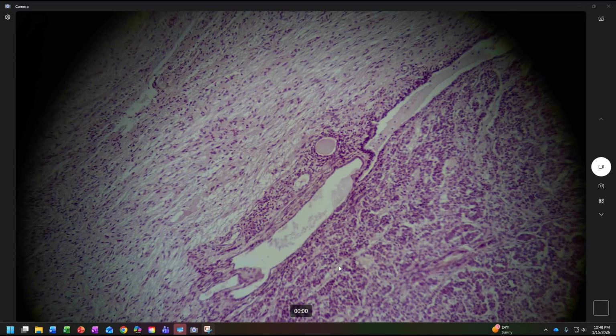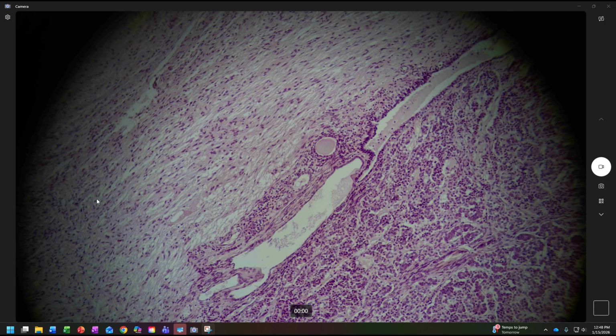Now, again, this doesn't look exactly like the slide we had before, right? We can see some differences, but what is consistent? Look at the lighter, less packed together area over here, and this is the posterior pituitary. This area here is where the cells are more packed together. And remember, one of the things you should work on is identifying what is a cell, so that you know where one cell begins and one cell ends. Not that you're going to get asked that on an exam, but it's going to help answer these kinds of questions and help you identify things.